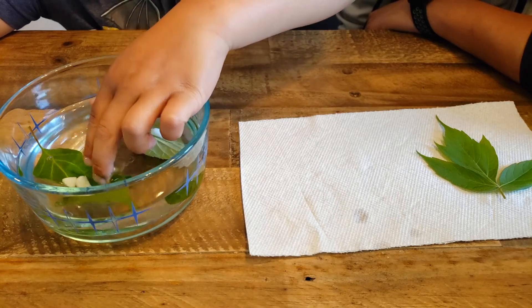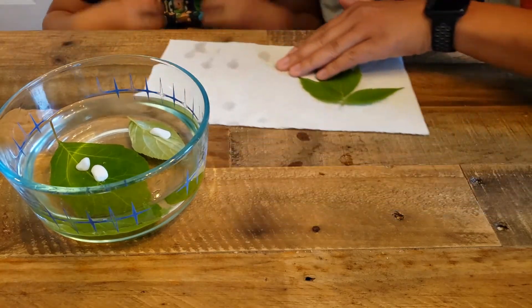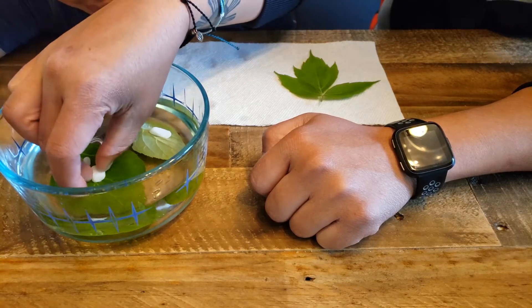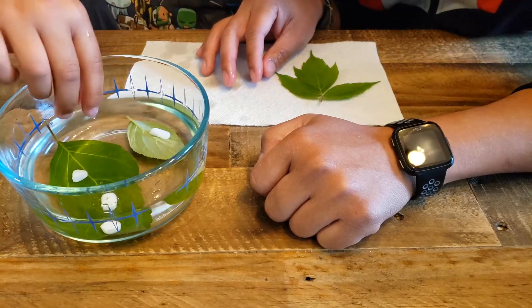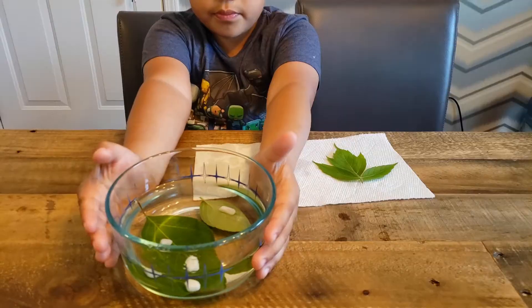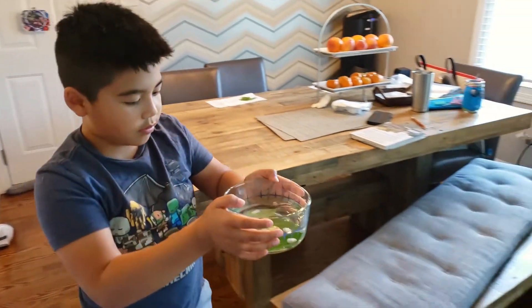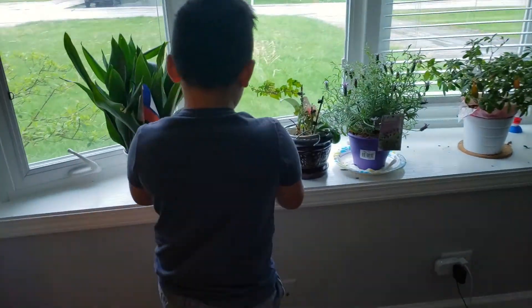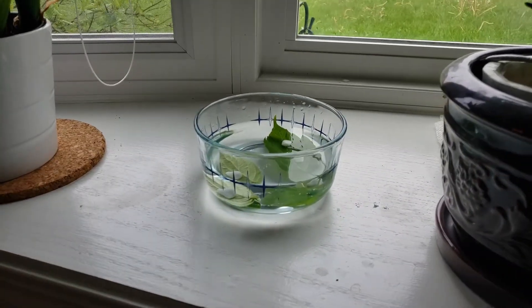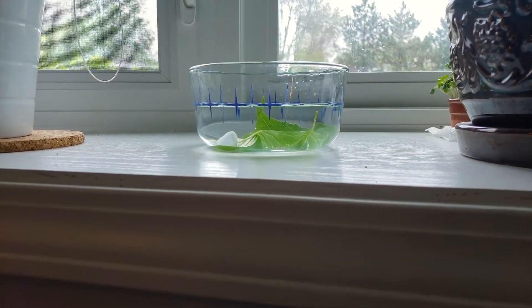Push it down — you can use two hands. It works! Eureka. I'm going to spread these out a little bit. They're both underwater now. We're going to come back in a couple of hours and record our observations. Let's see what happens. We're going to move it very carefully over to a sunny spot. It's okay if the leaves start to float when you move it — just push them back down and it will be okay. They're both underwater and we're ready to come back in a couple of hours.